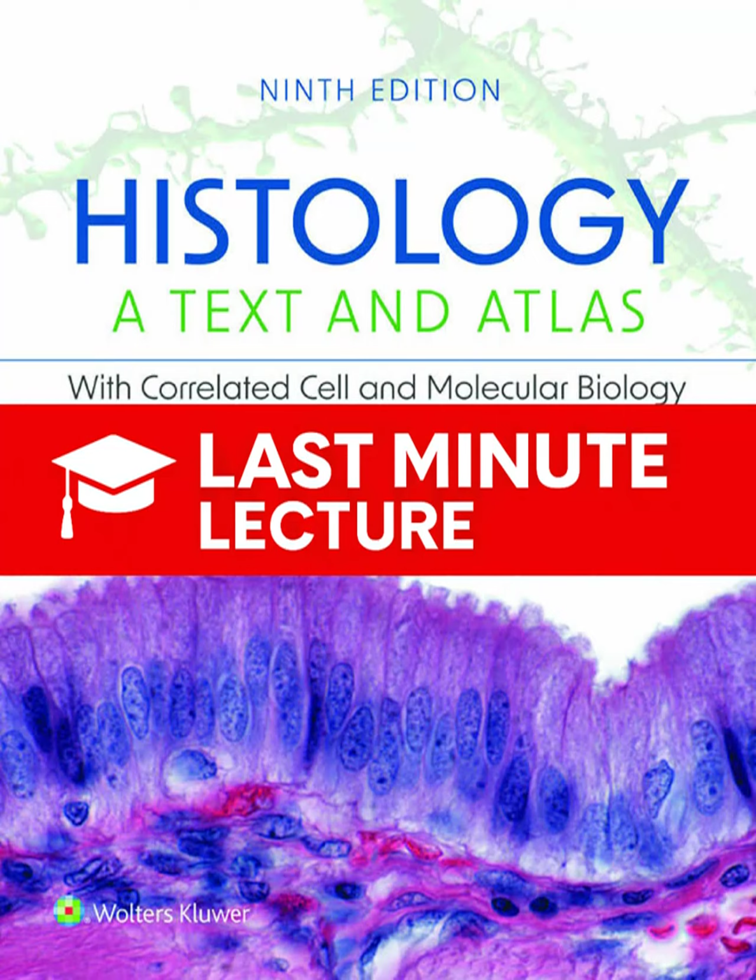This brings us to a technique that just feels like science fiction: expansion microscopy, or XM. The ultimate physical limitation of light microscopy has always been that diffraction barrier, that 0.2 micrometer limit. Right. And XM just finds a way around it by physically stretching the specimen itself. It is the definition of a disruptive technology. Instead of trying to make a better microscope, XM makes a better sample. It physically expands the tissue, pulling those previously crowded structures so far apart that they're no longer limited by diffraction, and you can resolve them with a normal light microscope.